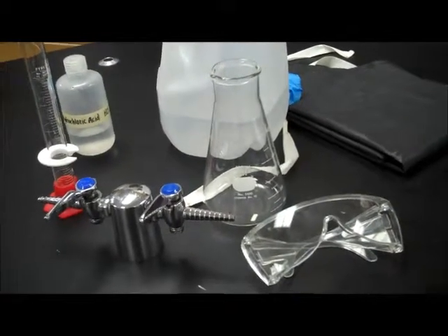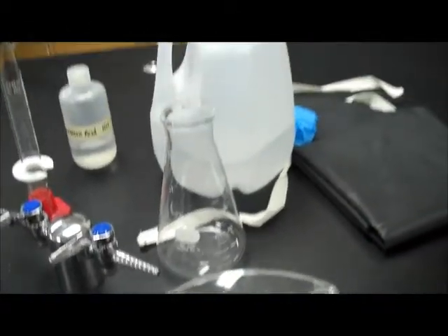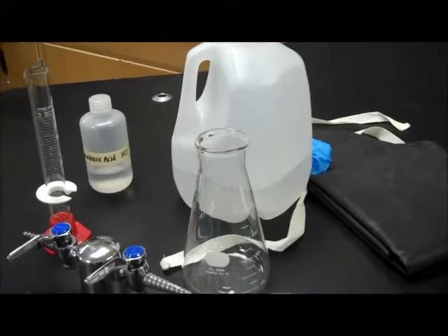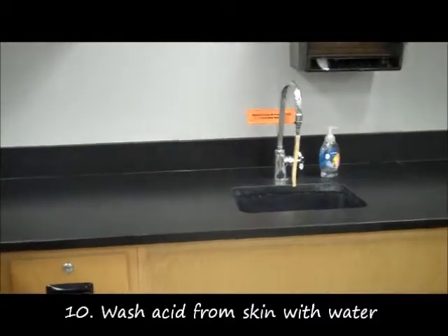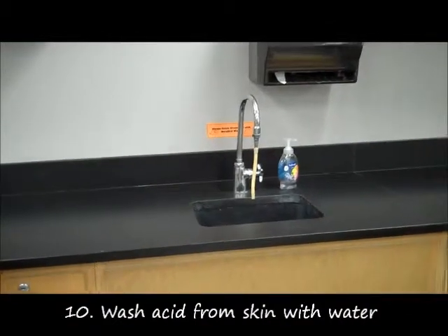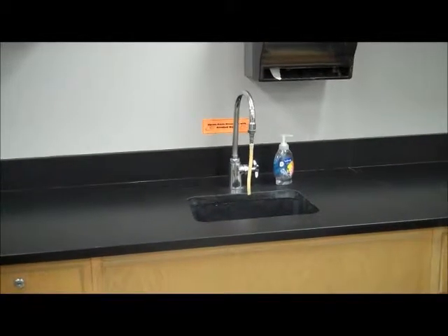It's also important when you're working with acid that you wear gloves, an apron, and goggles. These will protect your face and your hands and your clothes from the acid. If you get acid on your skin, go directly to a sink and wash it with a lot of water. Don't use soap when you're washing the acid off of your hand because the soap may react with the acid. Just use a lot of water and send one of your lab partners to come and get the teacher.